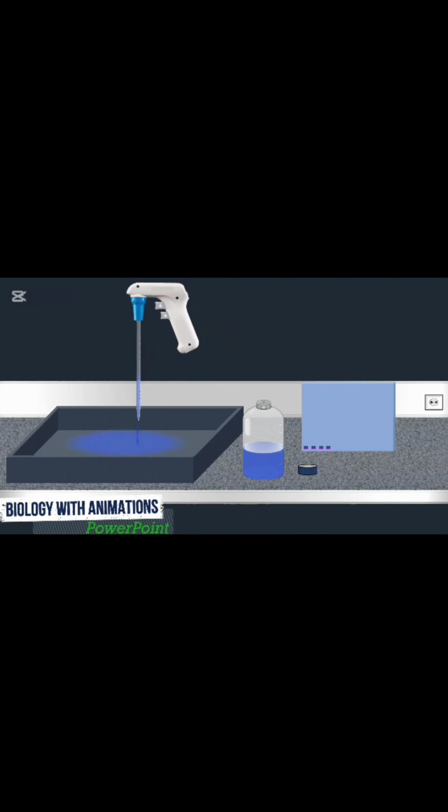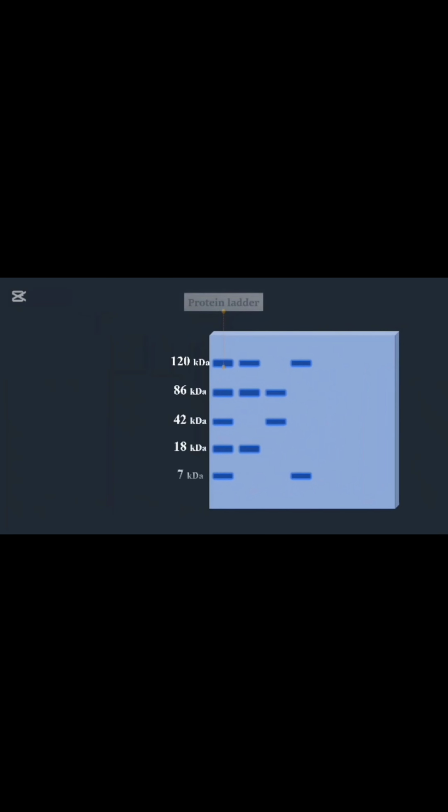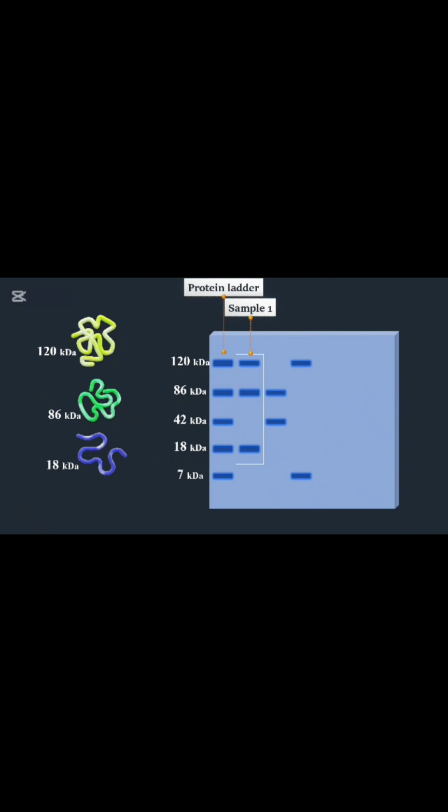All proteins are sorted by size and can be analyzed by other methods, for example, protein staining methods and immunological detection, such as the Western blot technique, after removing the gel glass plate. The stacking gel is disconnected and the separating gel can be stained. Coomassie blue is the most popular protein stain. It is an anionic dye which non-specifically binds the protein. It detects blue bands in a separating gel to determine the unknown mass of a biomolecule by the distance traveled relative to the marker.